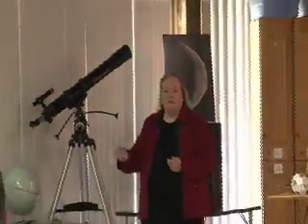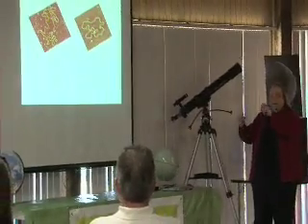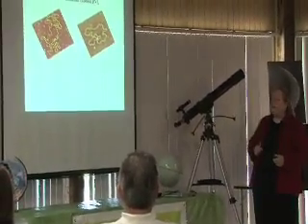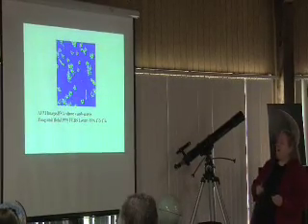And you can color your AFM images black and white or with different colors. Here's some strands of mitochondrial and plasmid DNA. These are from different types of organisms, and they look like ropes that are sort of randomly arranged on the surface. And here's another one, DNA silane condensates.